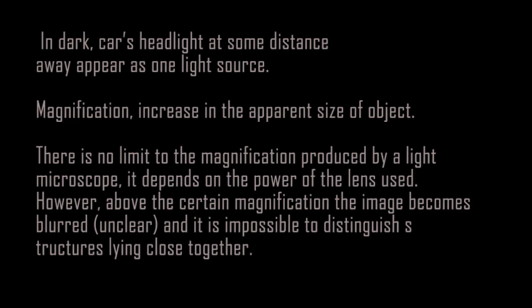Second, above a certain magnification, the image becomes unclear. At this point, it is impossible to distinguish structures laying together.